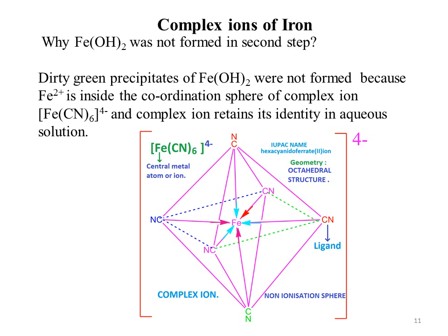What happens is only the 4 potassium ions are exchanged with sodium ions, and as both of these cations are colorless, यहाँ पर हमें कोई और color की appearance नहीं मिली. हाँ, instead if these potassium ions are replaced with some other transition elements, so you will see some different color.